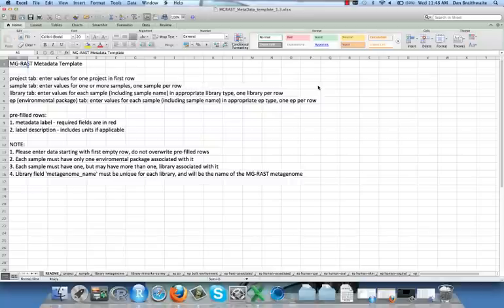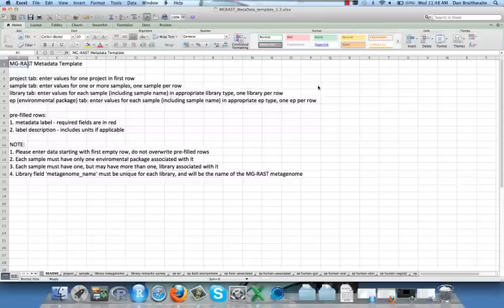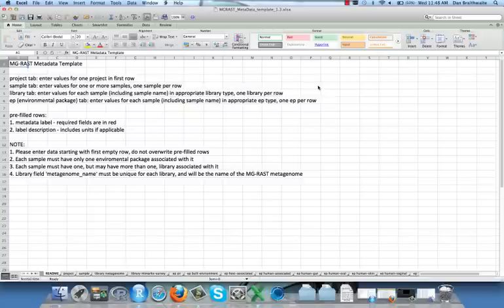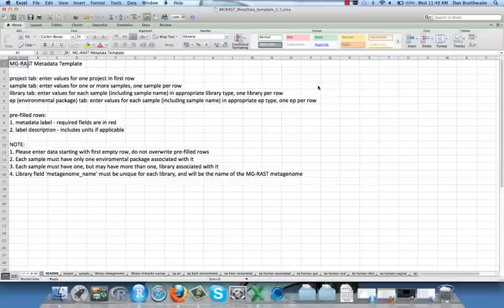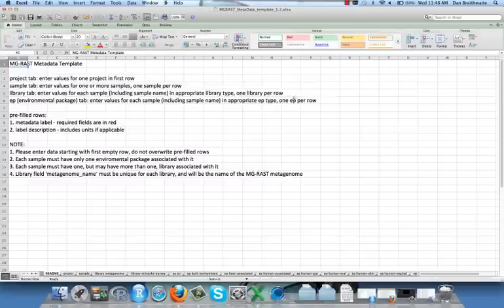Do not change the names of sheets and only enter text in blank cells. Some fields are freeform, but most require either a very specific format or a term exactly chosen from a specific list. This will be checked by a validation program in MG-RAST, but as you will see, there are detailed instructions to help you.